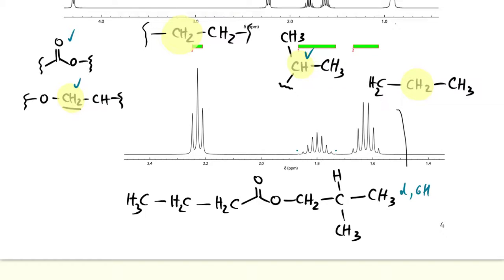As far as mass spec, we have some fragments that we can chop off, and maybe they will match masses. You can do that yourself. Probably this may fall off, this may fall off. So count up the atoms that are there and see what you can find. Or the total mass of the molecule minus methyl group, minus ethyl group, and so on. Okay? These will be your fragments.